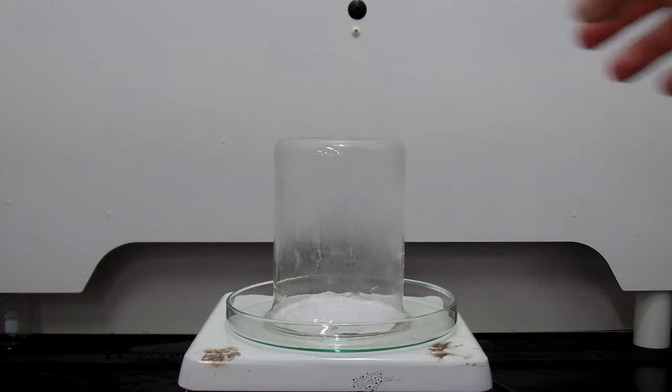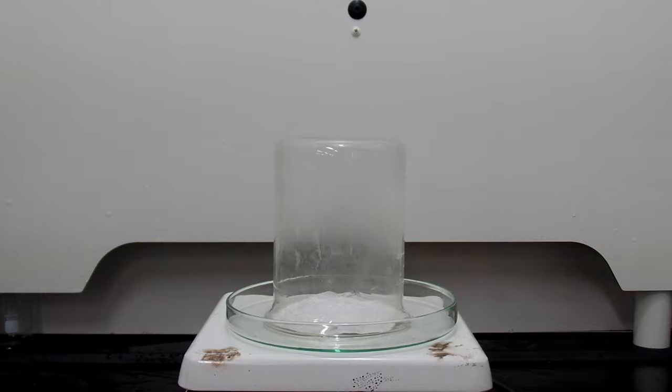One thing you should be aware of is that the combustion of nitrocellulose actually produces nitrogen dioxide, and ignition should be done in a fume hood or well ventilated area.